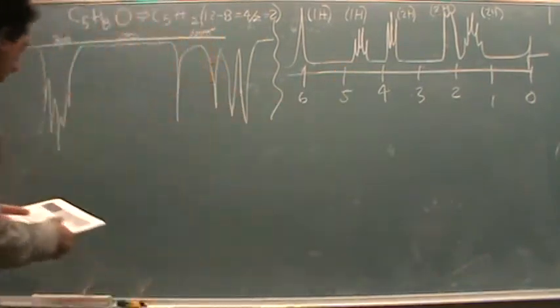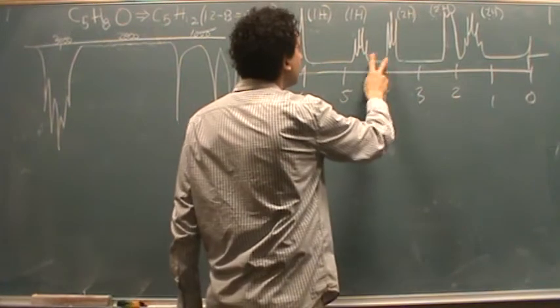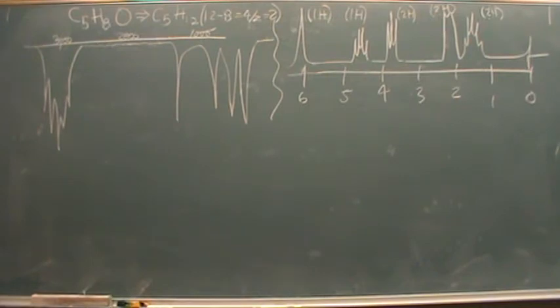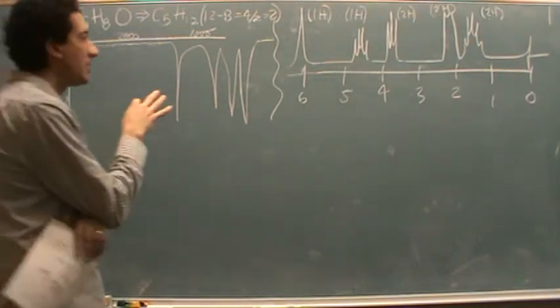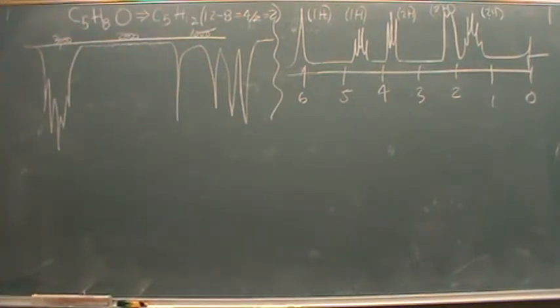But anyways, we know there's one hydrogen here. This hydrogen up there, that's next to a couple other things. Since those are the highest peaks, they're above 4, I'm kind of guessing that they could be right on the alkene. So sometimes hydrogens right on the alkene can be pretty high. And then one of these two, I would say, are hydrogens that are right next to the oxygen. Okay? So the oxygen's somewhere in that mess, but usually hydrogens right next to oxygen are a little close to 4, but usually more 3 to 4.